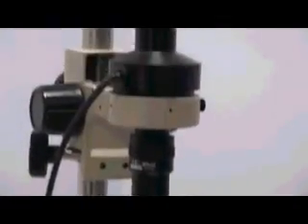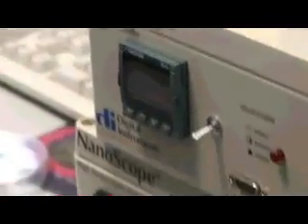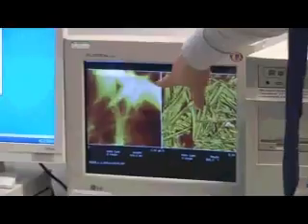Because nanotechnology is not just about small sizes, it's about small forces or anything that's in the sort of nanoscale. So we actually measure, for example, the forces between individual molecules. So say when two proteins come together, if you think about an antibody, that sort of Y-shaped molecule grabbing something, we can measure those forces. So this microscope here, which actually looks quite small, doesn't look massive or anything, but it has the power to see individual atoms or individual molecules, and it can do it in liquids, which is the key thing for us.